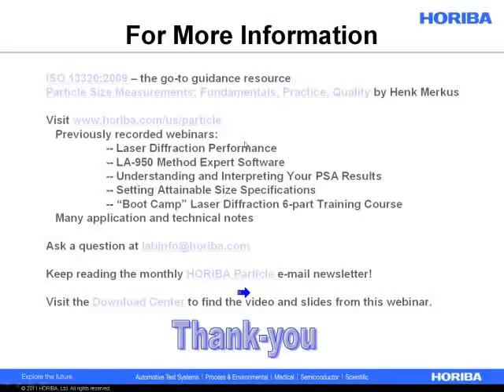If you don't care that much about accuracy, if you can accept maybe 5–10% inaccuracy, and what you really care about is the product changing in any way over time, so you're sort of monitoring your process performance, or if you're changing how you create the particle over time and you want to monitor that, then refractive index doesn't really matter. You just sort of need to be in the right ballpark.